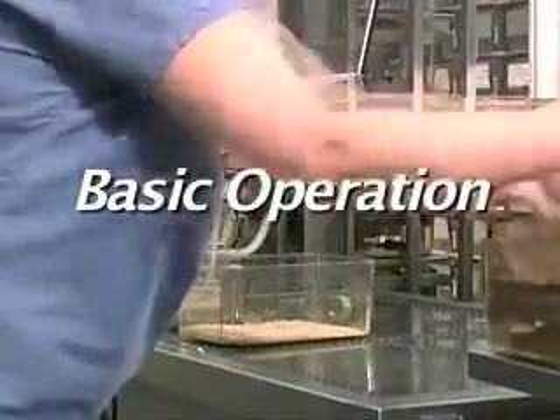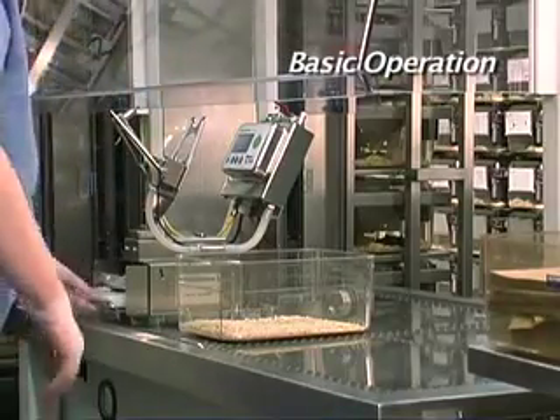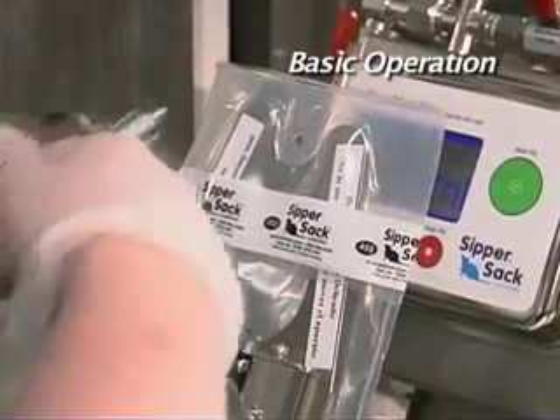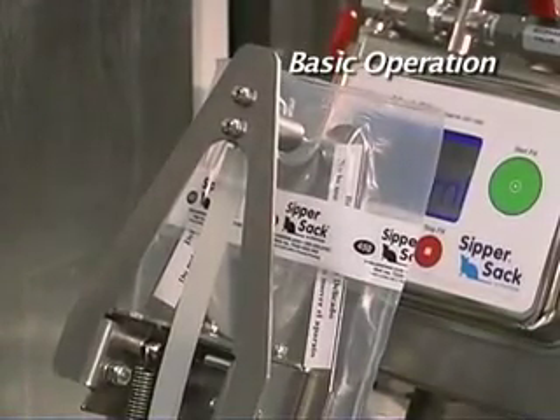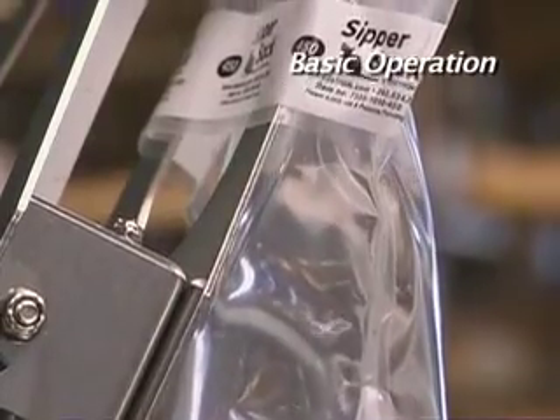Operation of the Edstrom Sippersack couldn't be easier and can be done using only one hand. Simply remove the sterile Sippersack from the packet and position it on the filler station. Engage the filler head in the reinforced fill port on the Sippersack and the fill sequence will begin automatically.